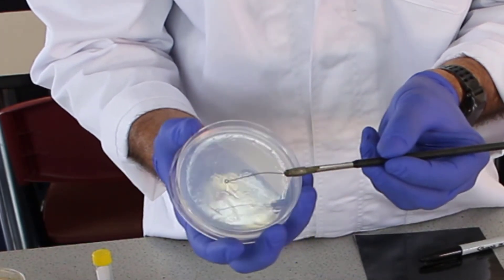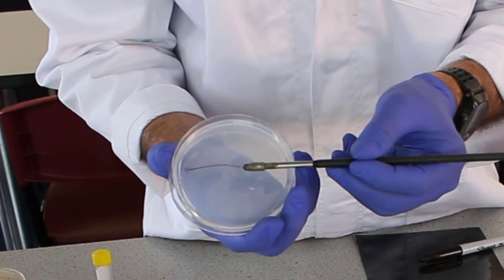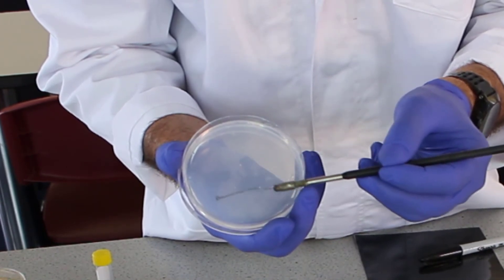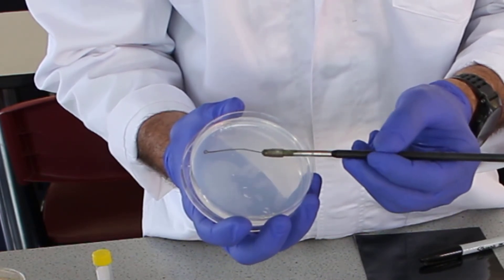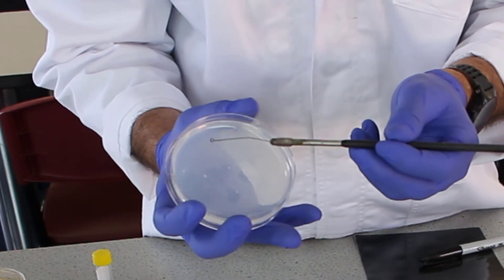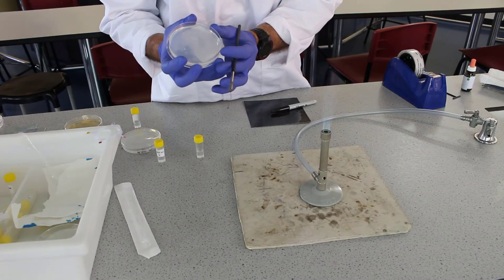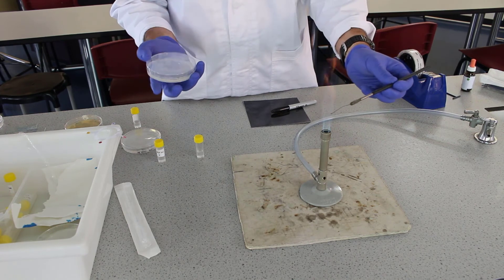Then we're going to turn the agar to the side, pick up where we last dragged that last streak, and do another four streaks, turn again, another four streaks. Generally what we do for the last one is take it into the centre, another four streaks, dragging that bacteria through, and then we can close the plate and flame the loop again.